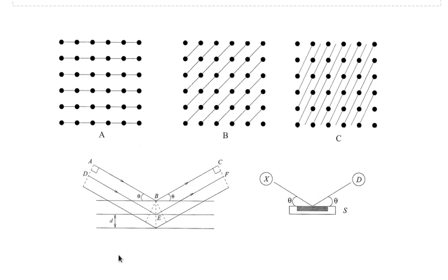So have a look at the Bragg manual. They'll describe the Bragg angle, and this Bragg angle is dependent on these planes that you see in the crystal. Just a note that the information you get from the instrument is always given as 2 theta, because you've got your X-ray emitter that's at an angle of theta to the sample. It shines X-rays at the sample, and that then comes back to the detector, which is also at an angle of theta to the sample. And so for historical reasons the values we get are 2 theta.